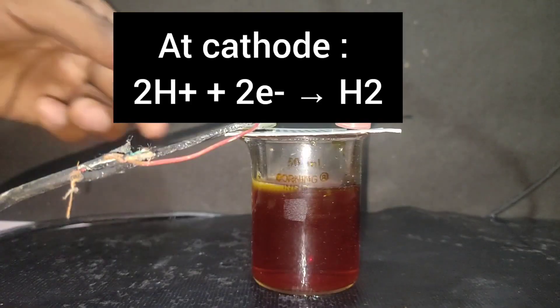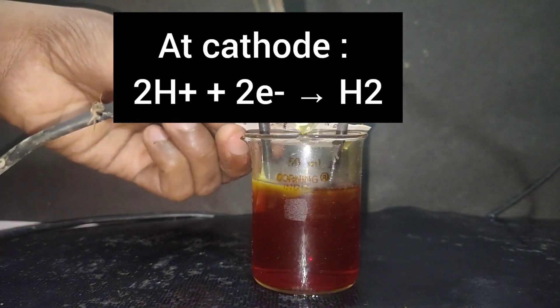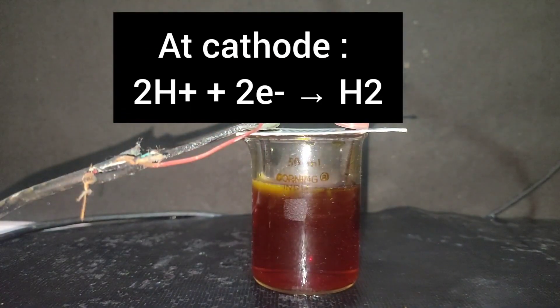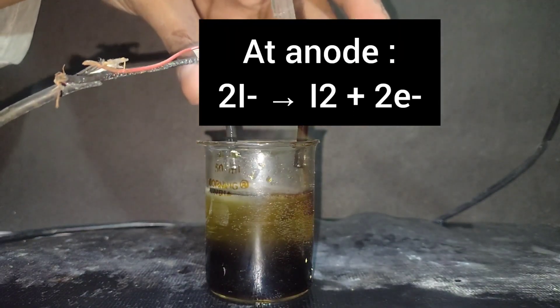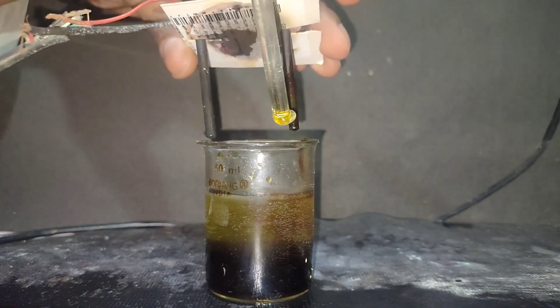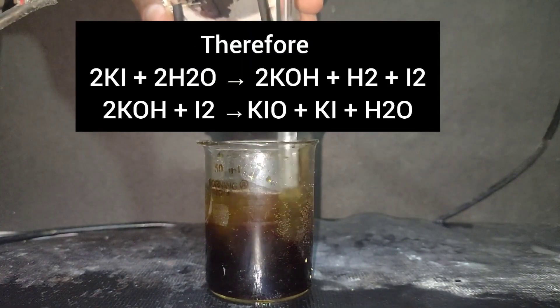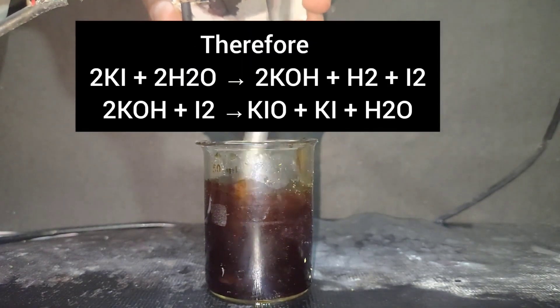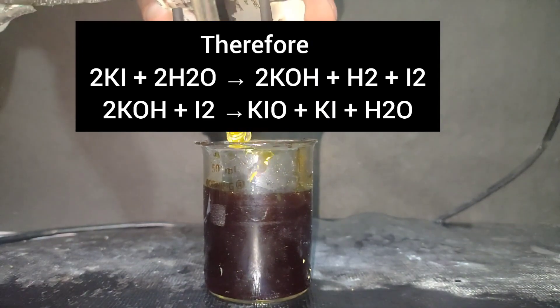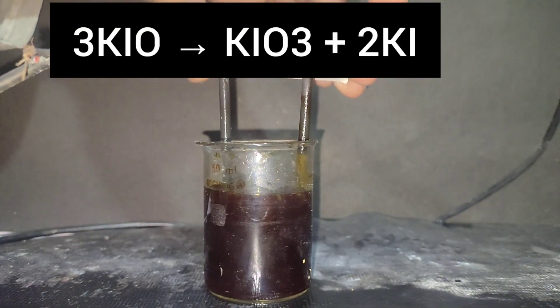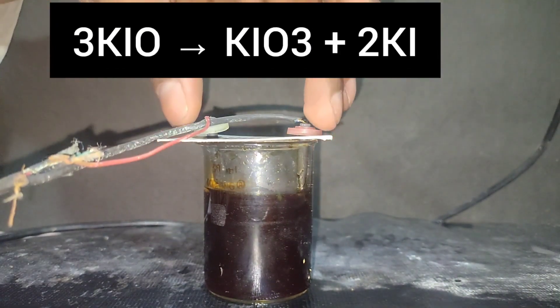So what's happening here is, the H-plus ions are getting reduced at cathode to hydrogen and the iodide ions are getting oxidized to iodine at anode. Now potassium hydroxide is formed in the solution, which reacts with iodine to form potassium hypoiodite, which further disproportionates to potassium iodate and potassium iodide.